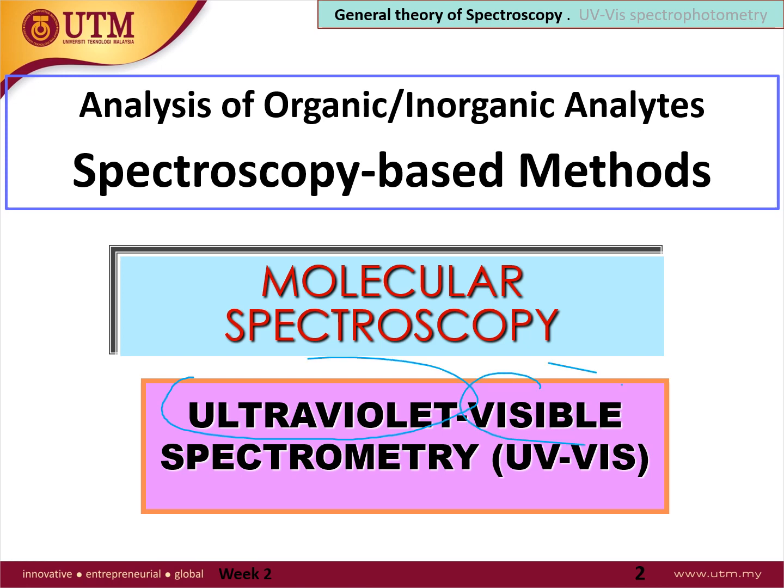At the end of this topic in this course, you will learn about what UV visible is, what makes it absorb analyte, and the instrumentation, and then we will go into application. So we will start with the theory of UV visible.